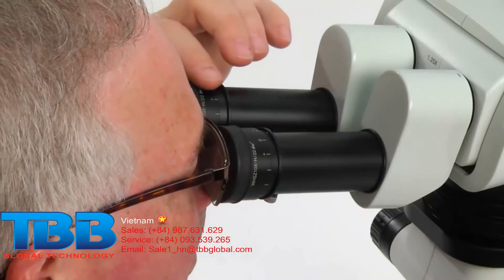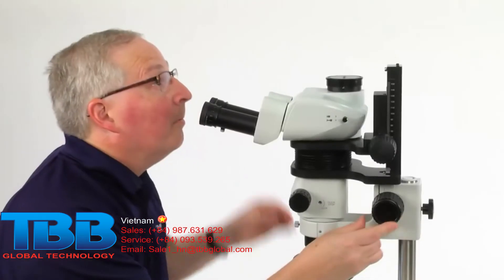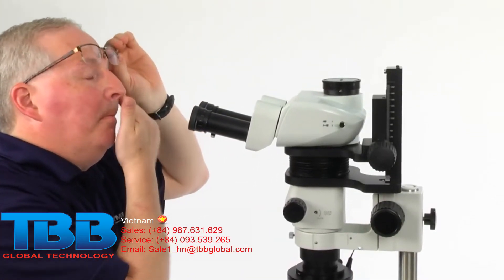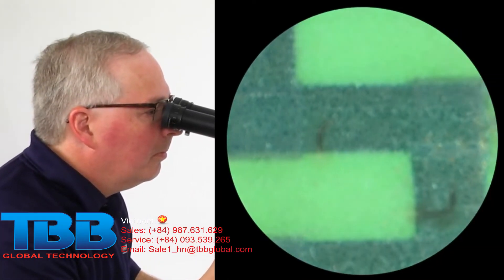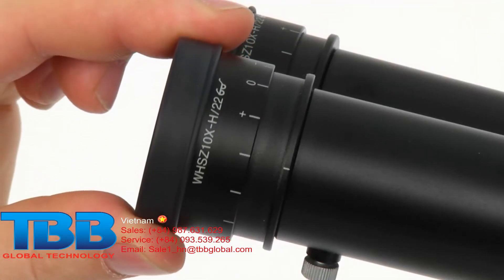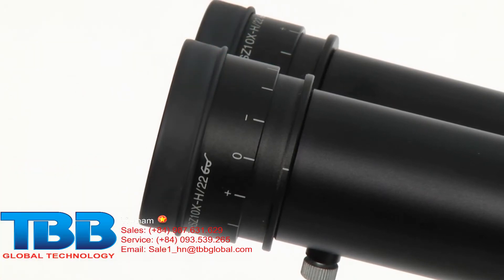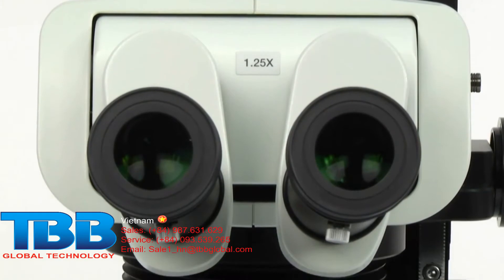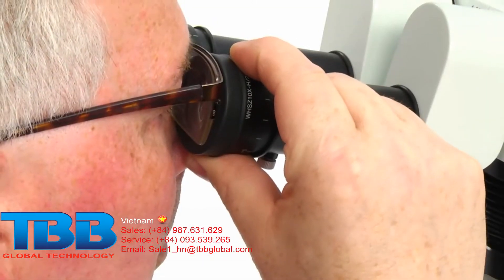The diopter adjustment is used to compensate for differences between one's eyes and is an important step in preventing eye strain that can lead to fatigue, as well as eliminating the tedious task of having to refocus the microscope every time the zoom is changed. To make the adjustment, turn the diopter rings of the left and right eyepieces to position zero. For operators with perfect 20-20 vision, this is the correct setting. All others require the following adjustments.